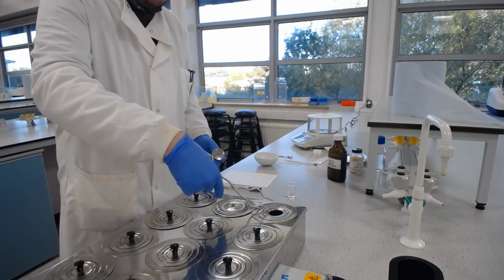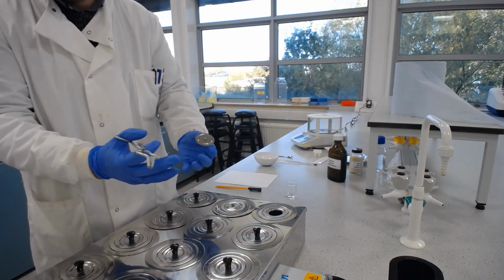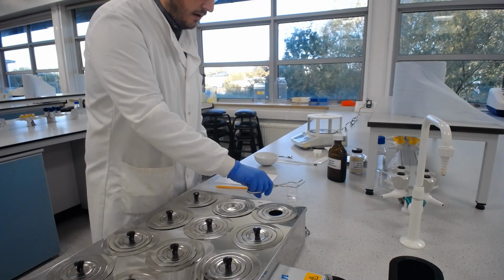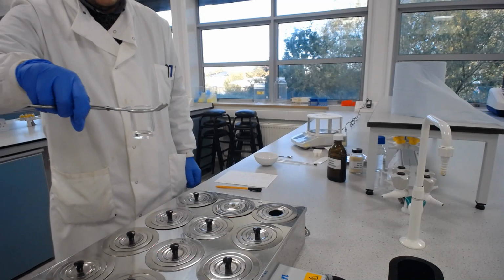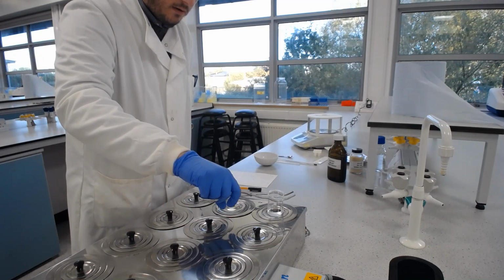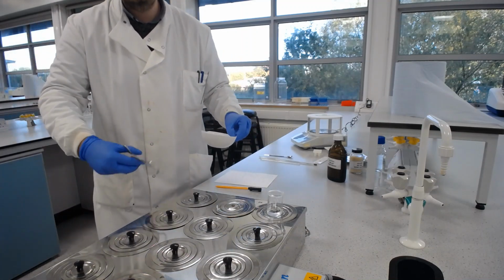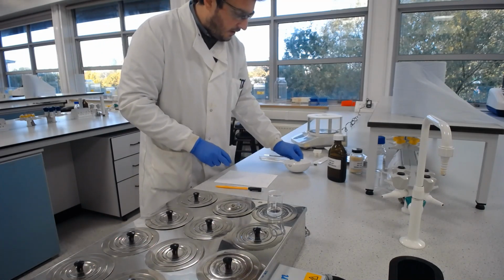So if we want to take off a different ring, we then use the tongs, so we can take off and have a larger well within which to put our vessel. In this case, I'm not going to need to do all of that. I'm just going to put the beaker straight on. And you can see here that these tongs fit very nicely around this beaker. You don't need to squeeze too hard and break it. And that fits over the middle ring. Later on, when we put the evaporating dish on here, I'll take off more rings so this can sit properly inside. Okay, so we need to now work relatively quickly.